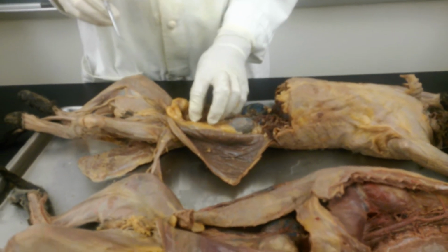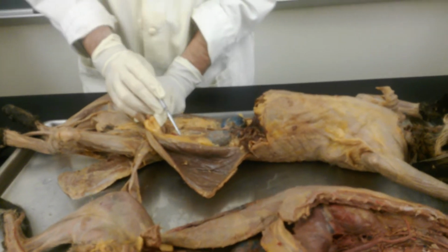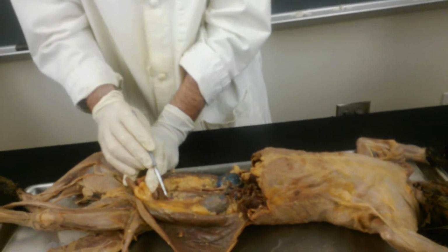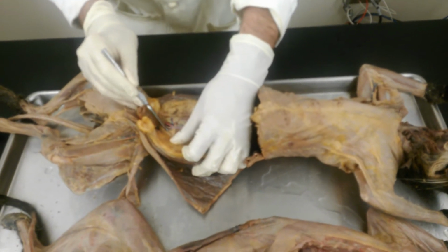This was a male cat that was neutered, so this one is a better one. Oh, well, but I did dissect out the termination of the post cava. Post cava splits into two large vessels, a right and a left common iliac vein.